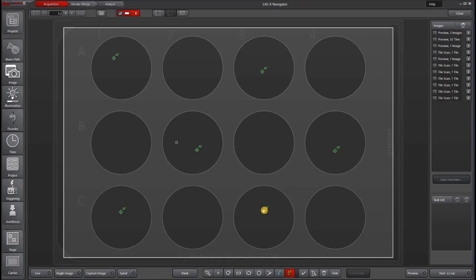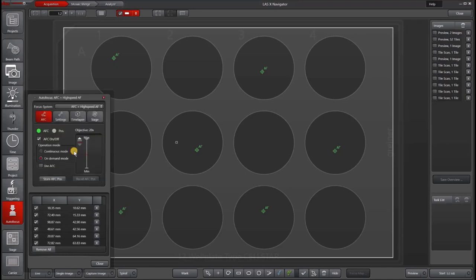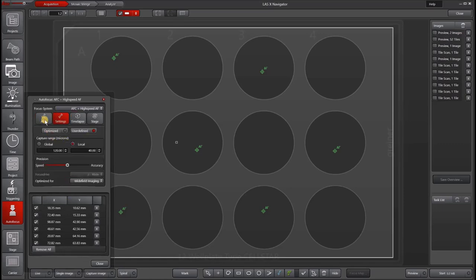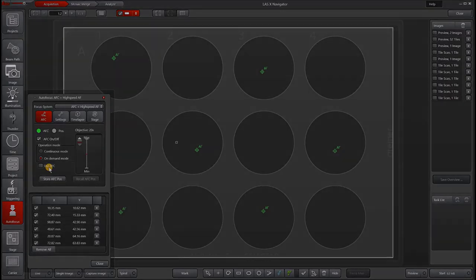You can also run autofocus with AFC adaptive focus control, which is the hardware autofocus feature that we have on certain DMI-8 microscopes. Under autofocus, you can go to AFC plus autofocus, and this will give you the same settings and also lets you control the AFC. For instructions on how to use AFC, please see our AFC tutorial. Combining both AFC and autofocus is especially useful for long-term time lapses, samples moving in and out of focus where you have to keep searching for the sample, and other challenging applications.